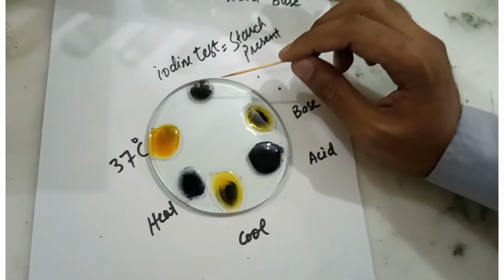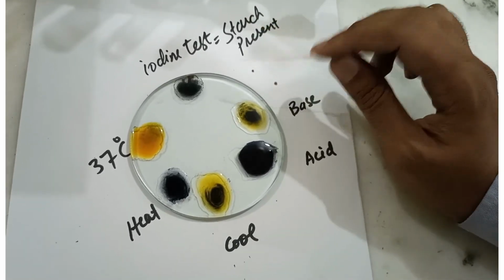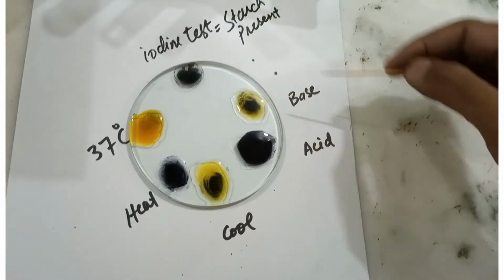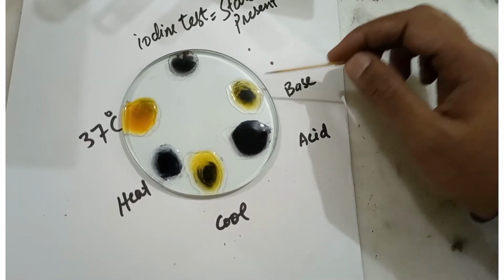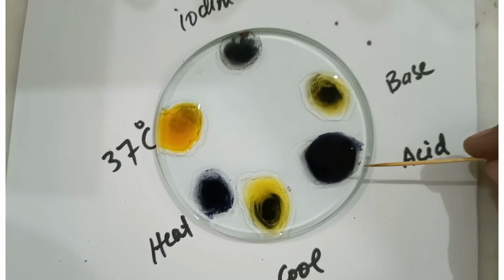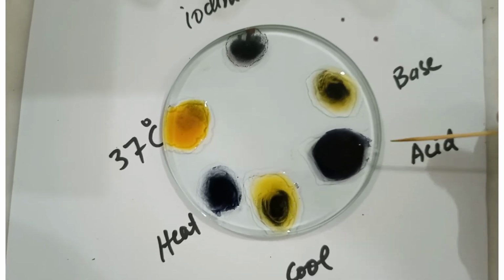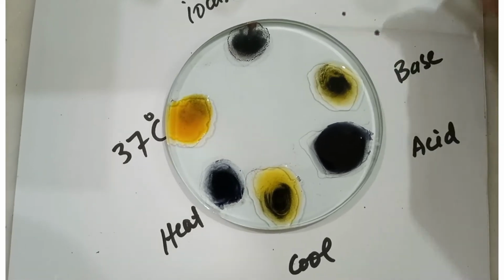Here we can see when we performed the iodine test, we put only starch and then put a drop of iodine here, and it gave us a deep blue color. When we put a drop from the test tube that was treated with a base, it gave us a blue color, because the enzyme could not work optimally in basic pH. In acid, the enzyme could not perform its work, so starch is still present in solution. When we put an iodine drop, it gave us blue color, like in the iodine test.